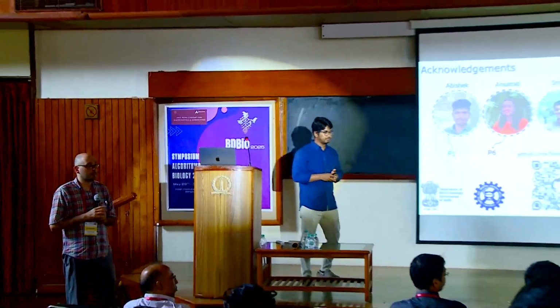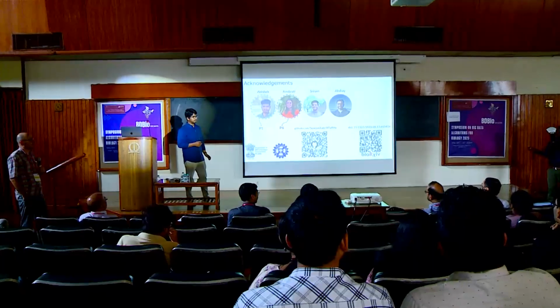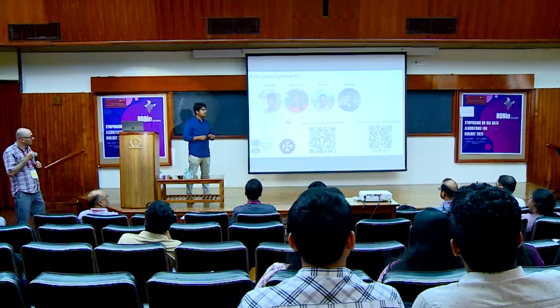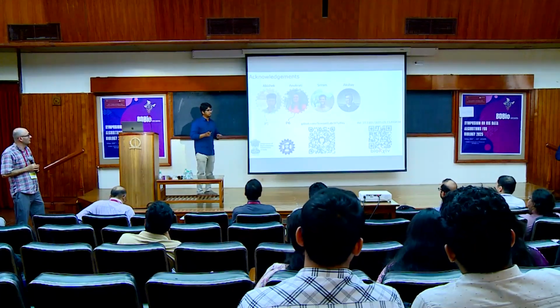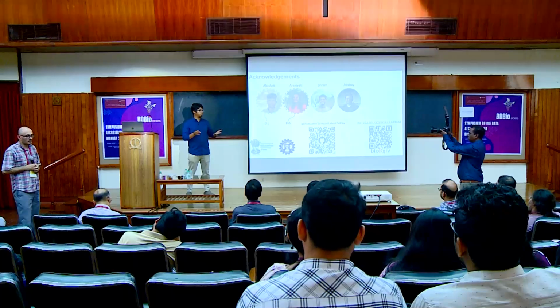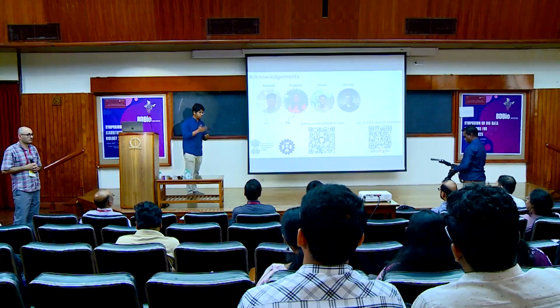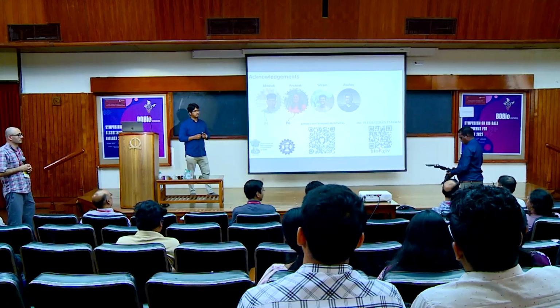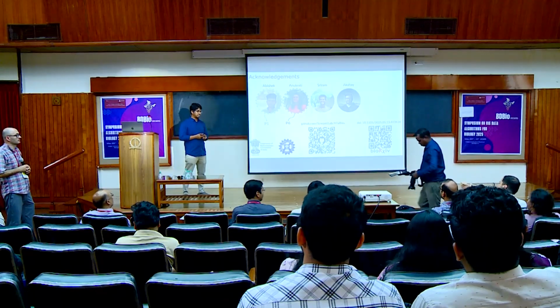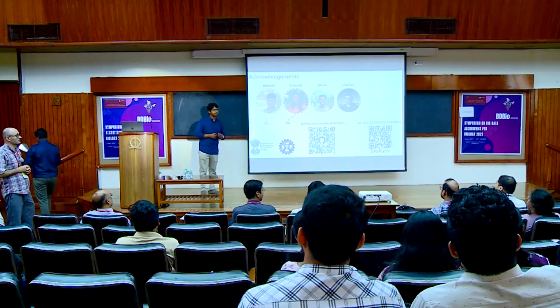Thank you, great talk. I have one practical question. Have you tried with some pharmacology important genes like CYP2D6 to recognize the copy number? So we have not done a specific analysis on this, but there are others who have tested all the pathogenic loci, and it does pick them in most cases. There are one or two it does miss, and we are still figuring out why that is. Many people are actually looking for a solution for this one because it is 4.5 thousand nucleotides long, and it can have zero or many copies, and many struggle to solve this problem.